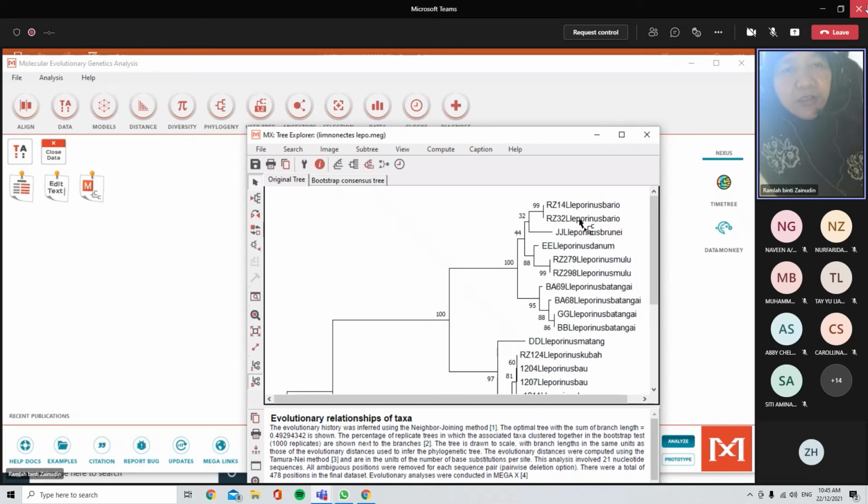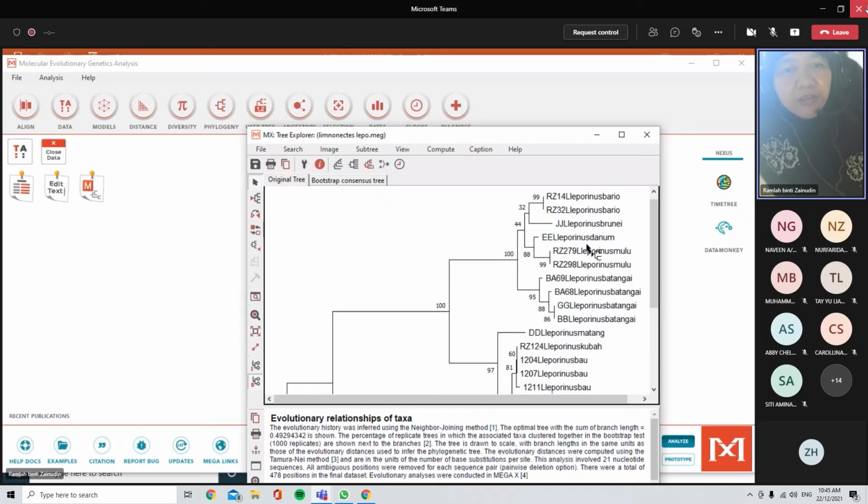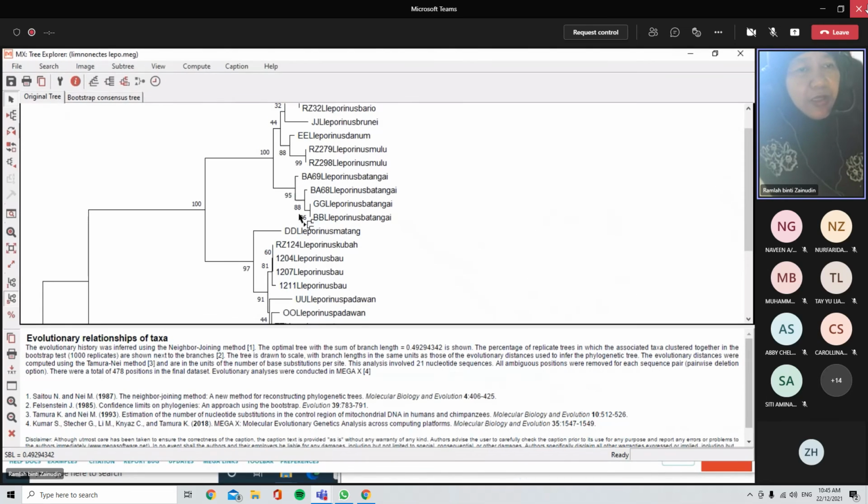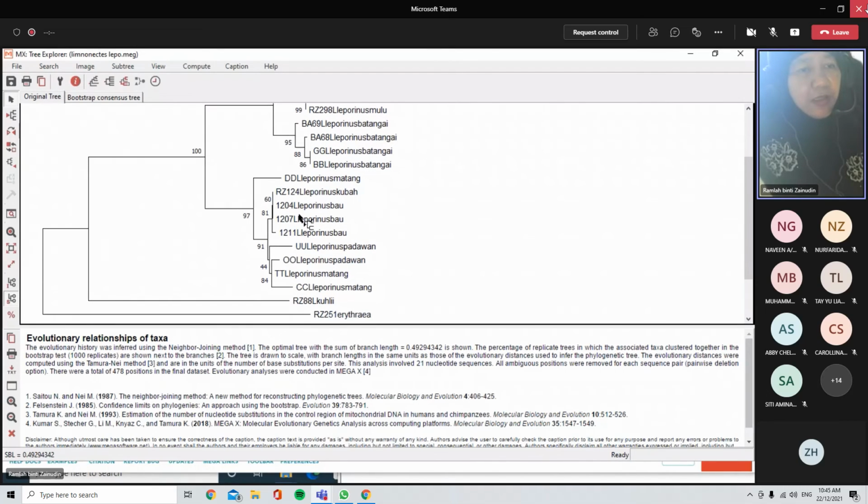Okay, so this is the neighbor joining. Tak ada jawapan, so I just continue. The neighbor joining, this is by distance saja. Tengok by distance. So you can see here. So how do you interpret the tree? You nampak the outgroup is outside. So you have 100%. That means all the sample, the in-groups monophyletic with respect to the outgroup here, Kula and Eritrea.